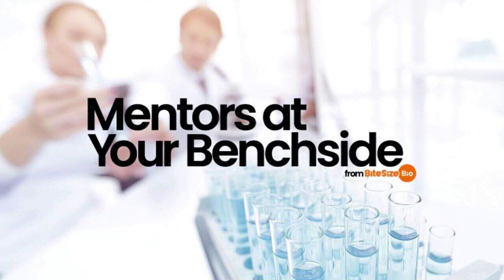If the precipitate looks like desiccated coconut, then things are looking good. If it looks gloopy, this is bad. Try to break up the gloop by mixing, this time a little more vigorously, but still quite gently, for a further 1 minute. If the gloop still does not break up, then the yield is likely to be poor. Next time, use double buffer volumes as described above.